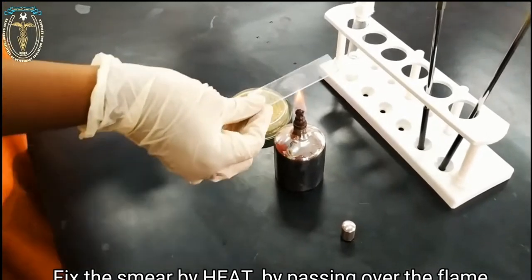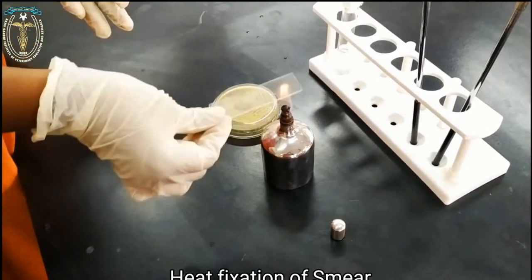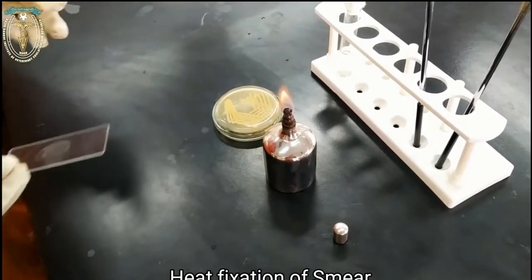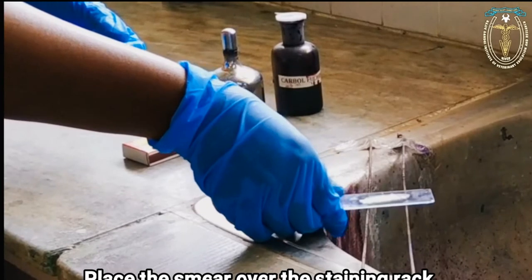Secondly, add the acid alcohol, the decolorizer, over the smear. Cover the entire smear with the acid alcohol, and allow it to act over the smear for 2 minutes or until the smear is sufficiently decolorized to pale pink.